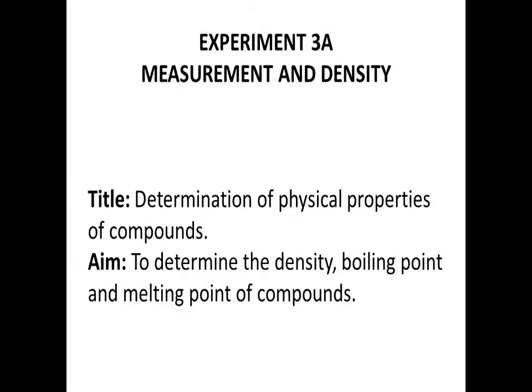I would start with our experiment 3A. The title is Determination of Physical Properties of Compounds. And the aim of this experiment 3A is to determine the density of compounds.